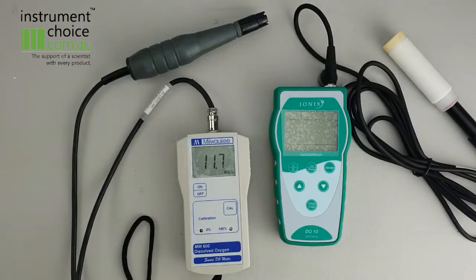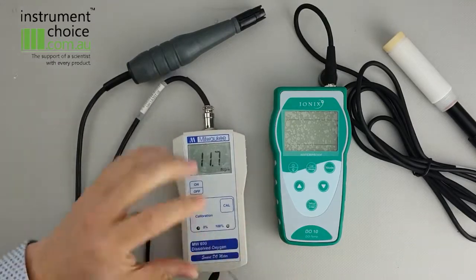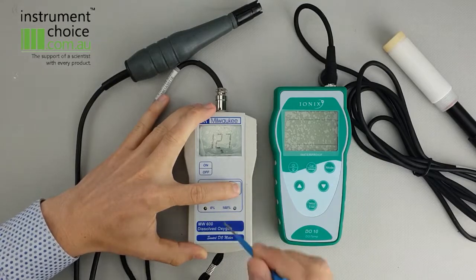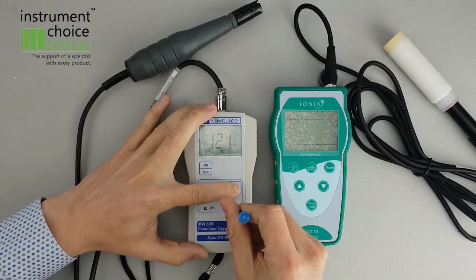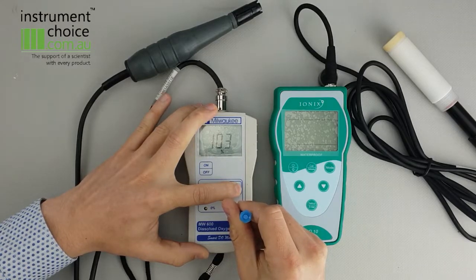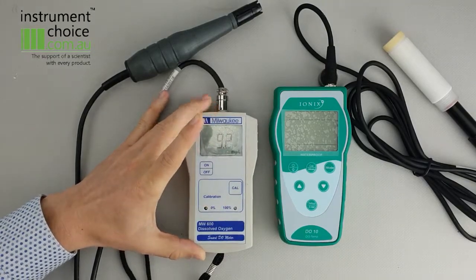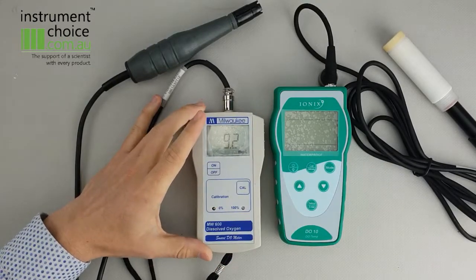Now that that's been sitting for approximately five minutes, we'll just go through and do the 100% calibration. To do that, you just hit the CAL button. As you can see, currently it's at 127, so we want to adjust that down to 100%. It is quite a touchy screw, so just do it slowly. So once that is at 100%, just release the CAL button.